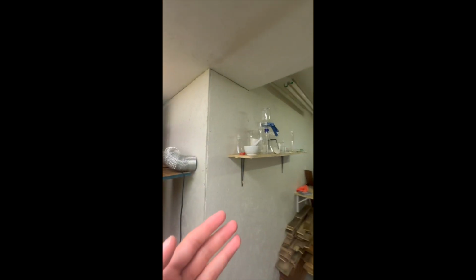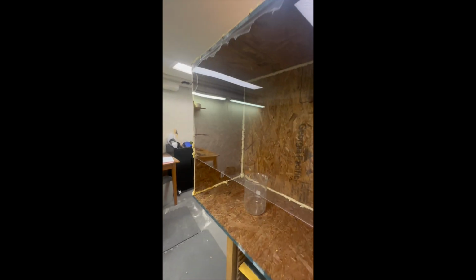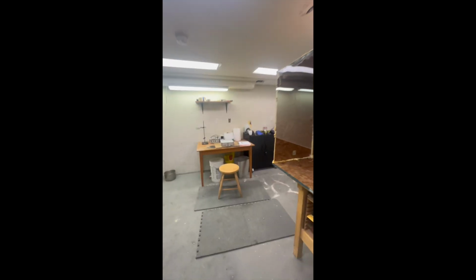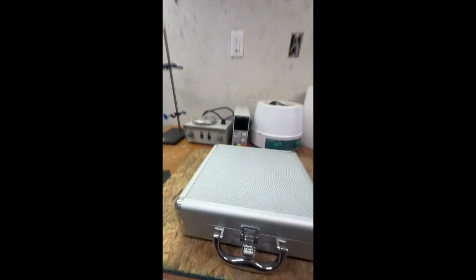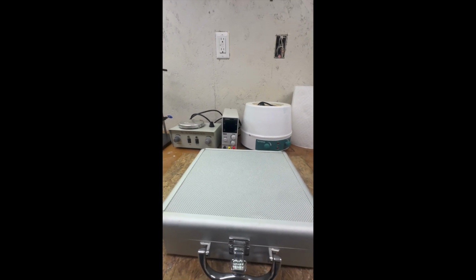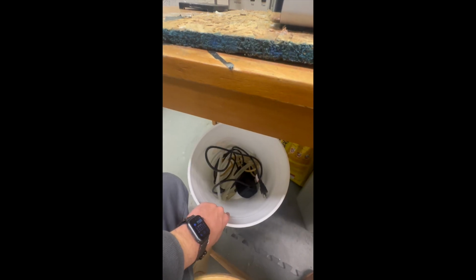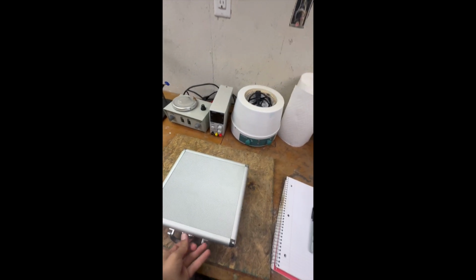Here is where I keep all my glassware. A lot of it is outside right now. I just did that iodine distillation and lots of my glassware is covered in iodine and I have to clean it up. So then here's my desk. This is my workbench, my place where all the cool stuff and experiments happen. Under it I keep kitty litter in case I have a spill, trash, and a water pump for distillation cooling. But most importantly, I wanted to show the chemical collection.